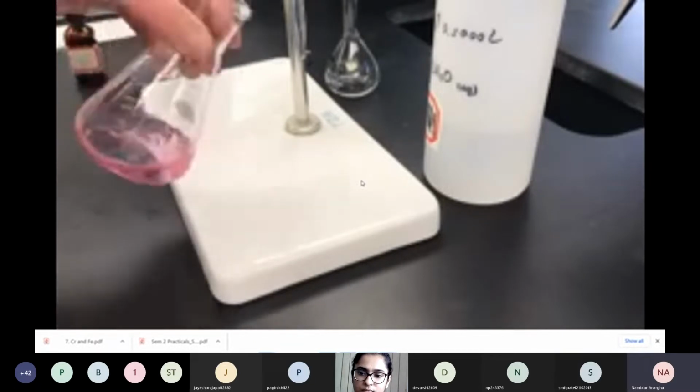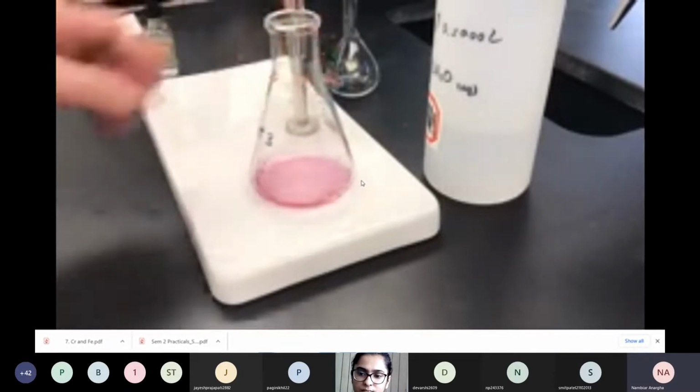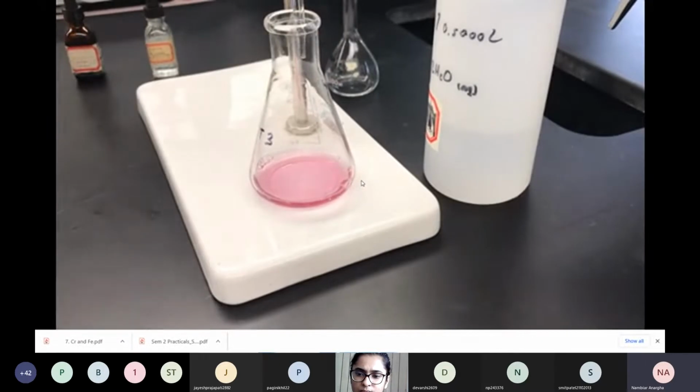So now what I need to do is get an initial volume on this burette, which I'll quickly do. So I have a paper towel here and I can read it. So it looks like I'm right at 0.00 on the burette. All right, so now we're going to begin the titration.